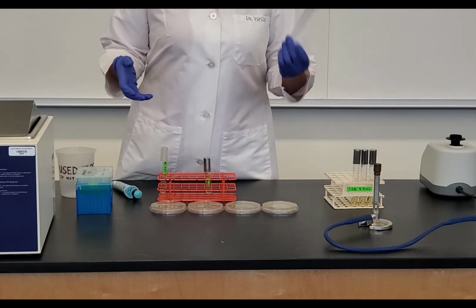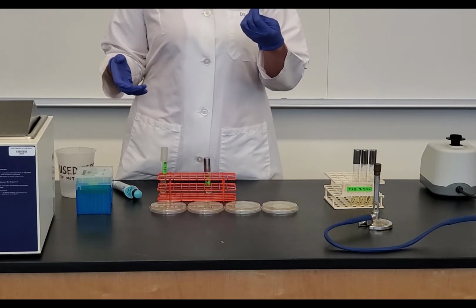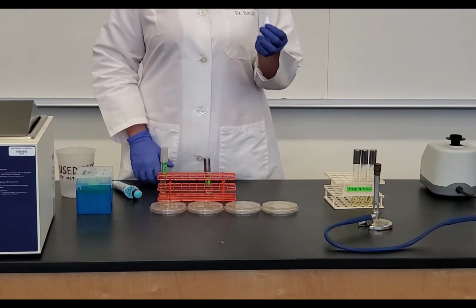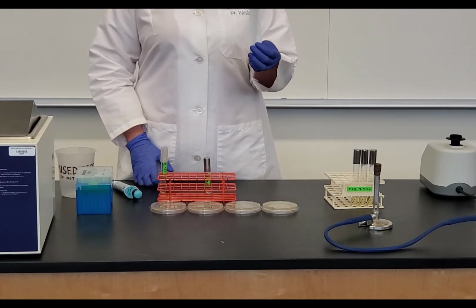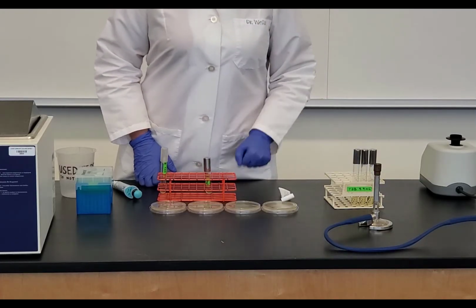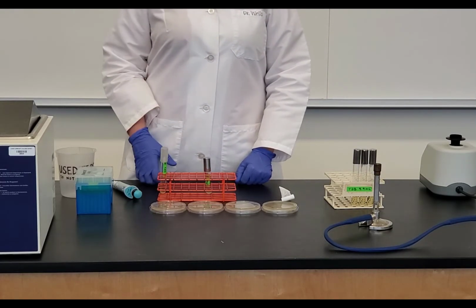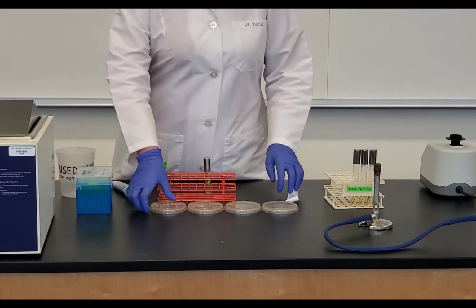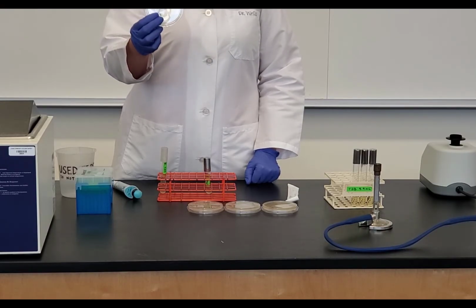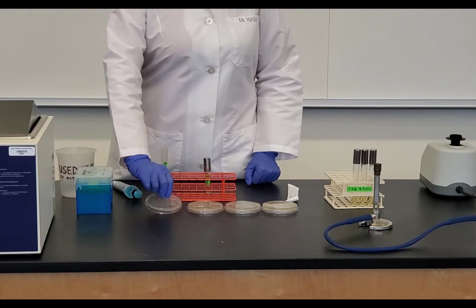I have a transfer pipette, and so this transfer pipette is going to be used when I need to transfer E. coli because I don't need that amount to be very accurate. So that's going to be for this. I have my Bunsen burner, I have my lighter, and so I also have my 4 tryptic soy agar plates. And so for these tryptic soy agar plates, these are going to be thin plates, and we overlay the agar over this. So we have 4 of these.